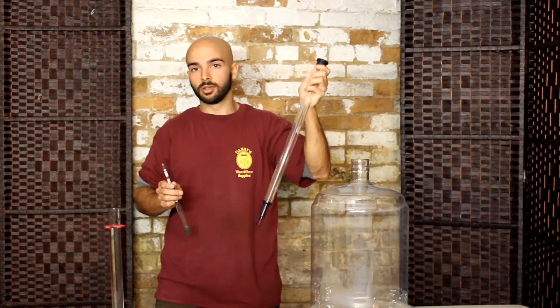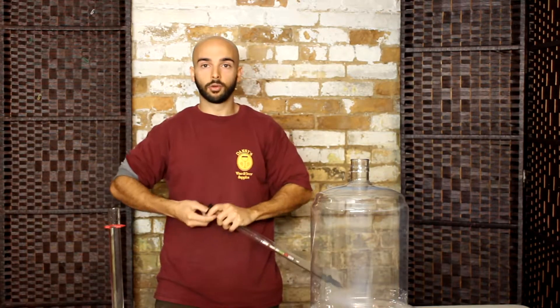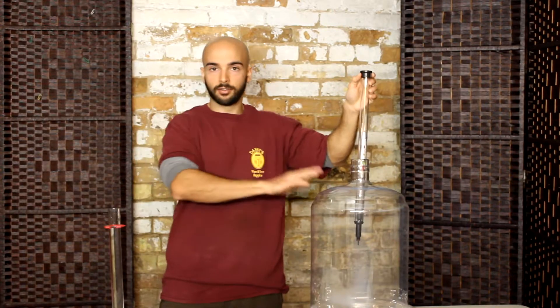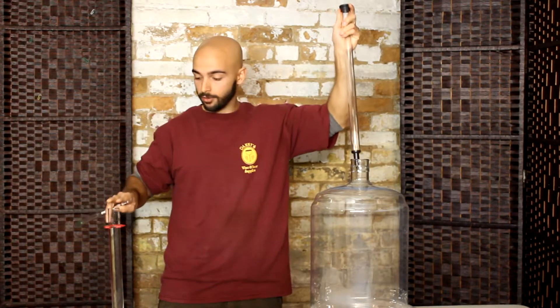Using a thief is a little bit easier because you can just take the hydrometer, place it in, and then float the thief right into the carboy — you don't have to siphon anything off into a test tube. But for this demonstration I have a test tube here filled up with water.